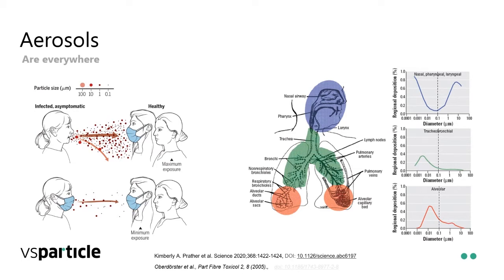And that offers up interesting opportunities. For example, if you see this little peak at about 10 nanometers here, you could consider delivering a drug very selectively into the alveoli of a human person.